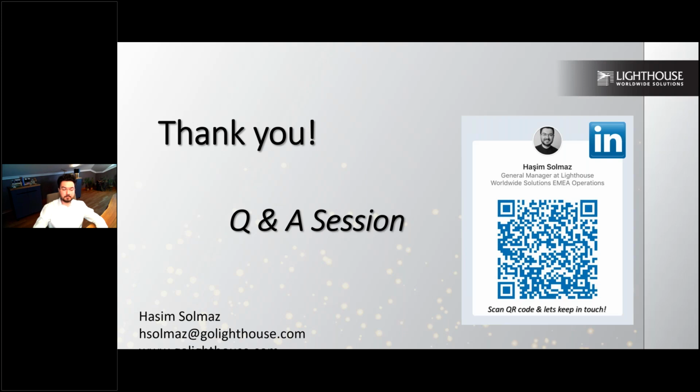There are many other methods for making a statistical calculation, but keep in mind, all team members should have a full understanding of your methods. If you are using, let's say, Student's t-test or other statistical methods, you will make it more complicated. So keep it simple. Take the average, take the standard deviation, the mean value, so that you will have a full understanding of what's going on in your cleanroom or controlled environments in terms of microbiological data.